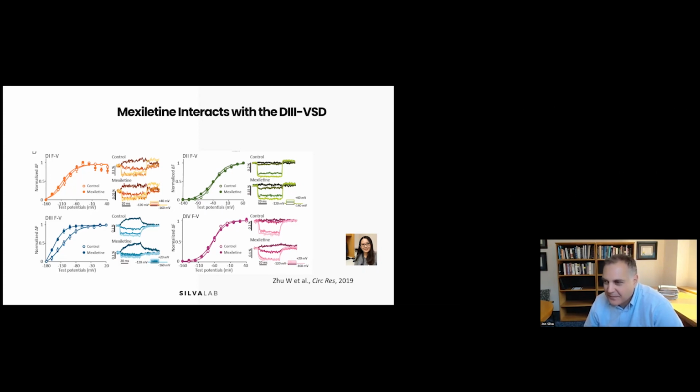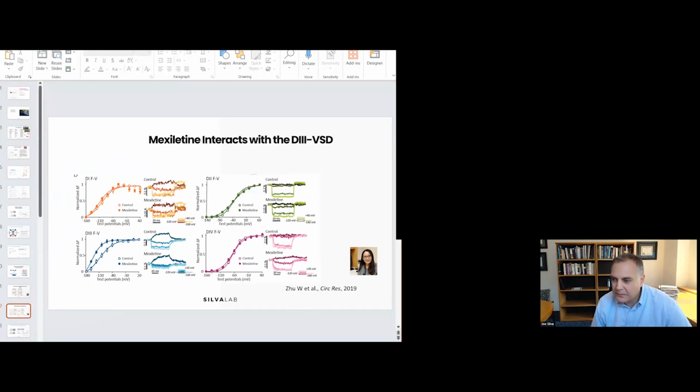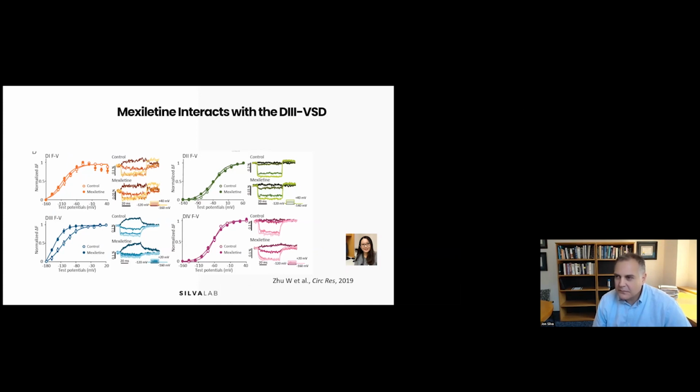Yeah. I have maybe one other question. The cells that you've been using, are they HEK cells with the mutated channel expressed in them, right? Yeah, we transiently transfect them. Okay, and then you use those on the patch liner. Yeah, that's worked pretty well for us. Okay, great. So you get a good transfection efficiency and therefore a good success rate. Yeah, I don't think we need 100%. We usually get 5 or 6 out of 8. That sounds pretty good for transient transfection. Yeah, and it would be a lot of work to make the stable cell line for each variant. So that ends up working quite well for us.